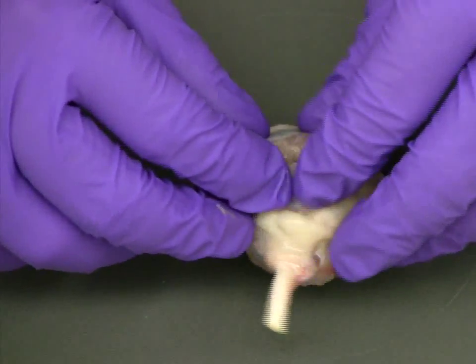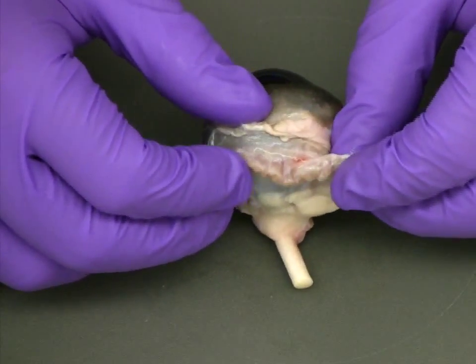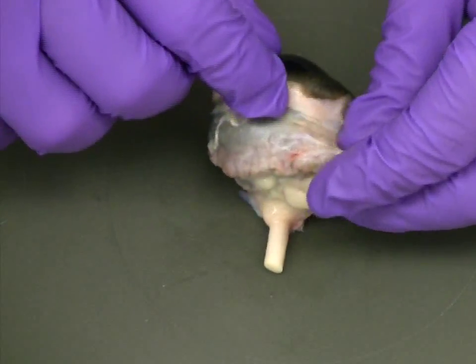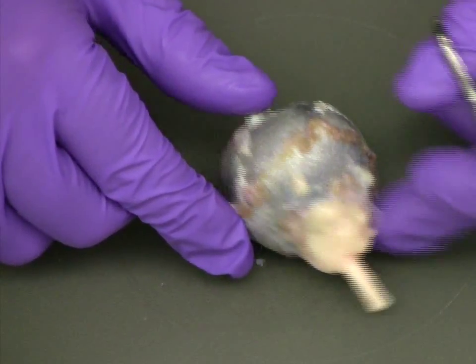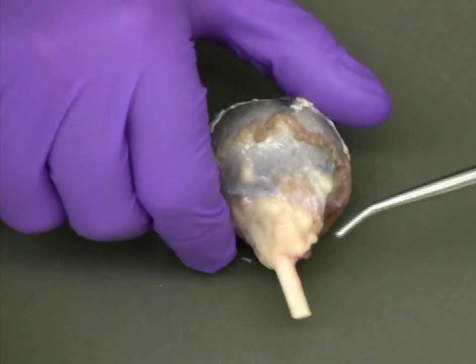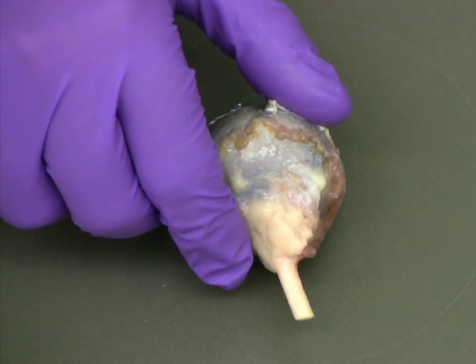One structure to observe while you are trimming the tissue from around the eye is the ring of muscle. This is the remnants of the muscle that actually controls the position of the eye within the eye socket. Another structure to take note of is the optic nerve, surrounded by a layer of fat at the back of the eye. Be careful when trimming away this fat, as you may damage the optic nerve.